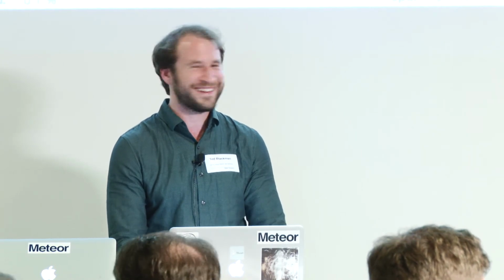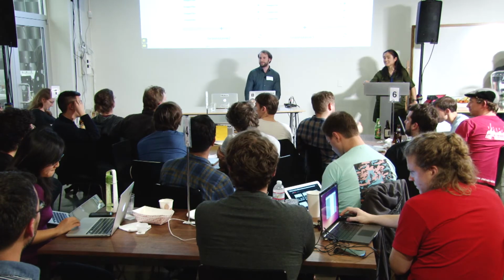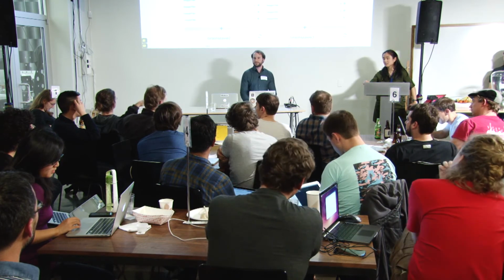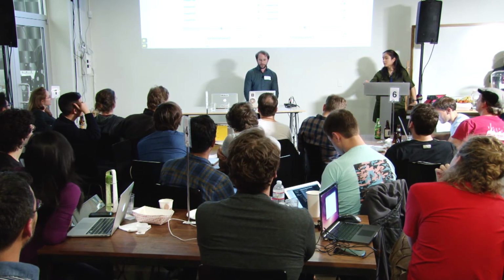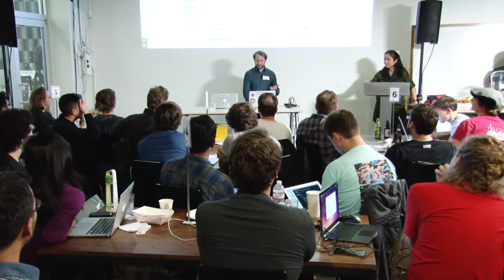You say you're actually using Meteor to control the scalpel? Not directly. The question was, are we using Meteor directly to control the knife? I mean, not directly, but to communicate with the robot? Yeah, sure. I'll give you a very brief overview of the topology of the system.